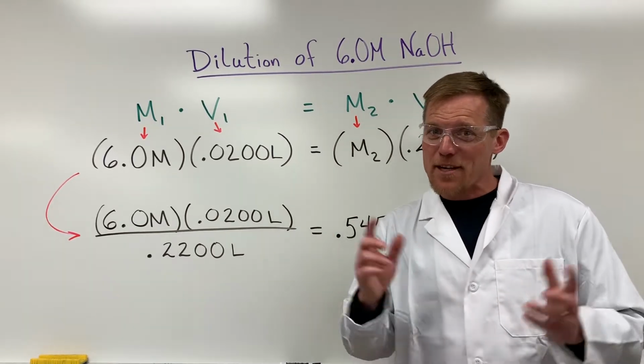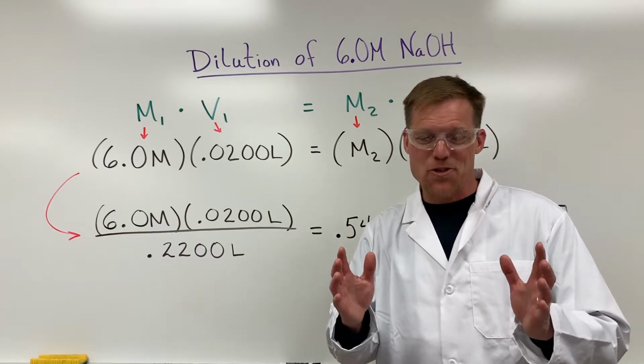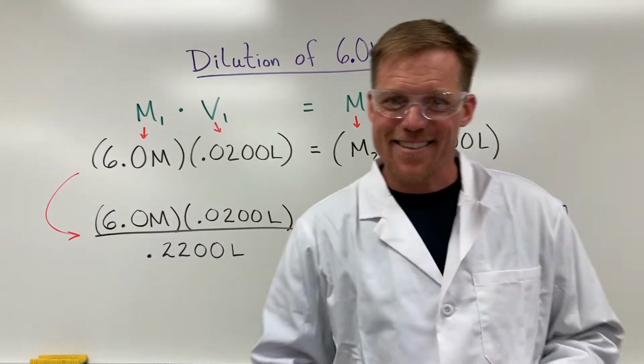All right, so that brings us to part 2, actually titrating. I'm excited about this, can't wait to show you what it looks like with the burettes. Let's do it.